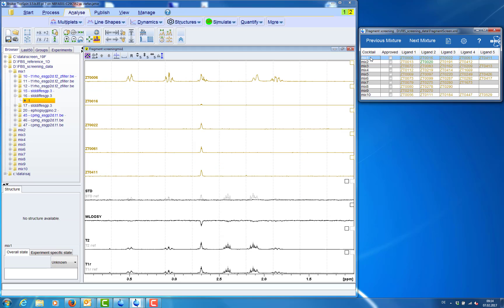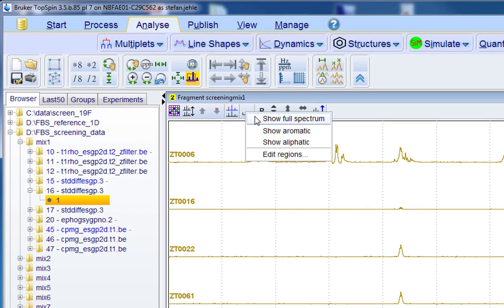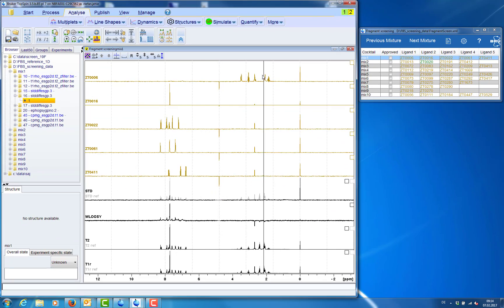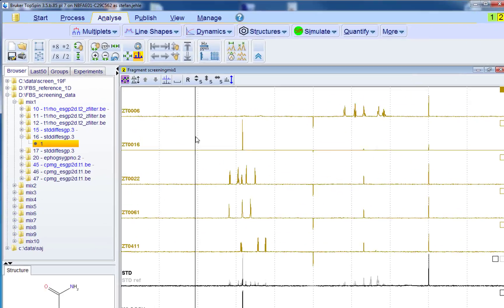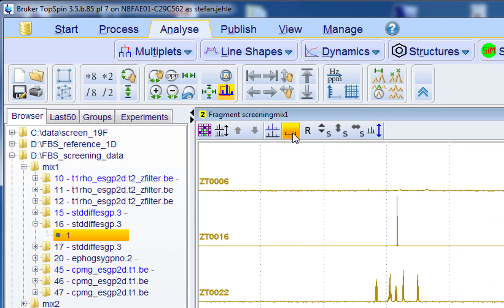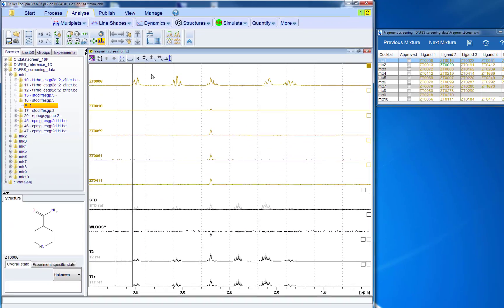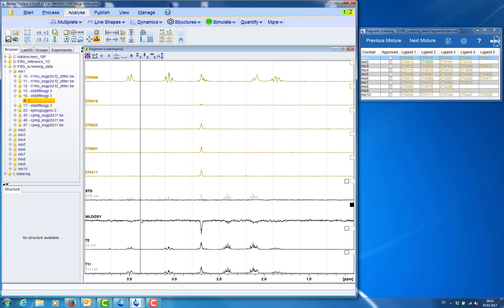Okay now we jump to mixture 1. And we want to see the full spectrum for this ligand here. We are interested in the aliphatic region. So we are jumping to the aliphatic region. And check the STD spectrum and the waterLOGSY spectrum for effects.